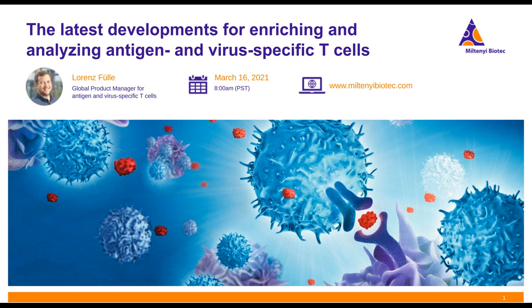All right, thank you. Moving on to your next question, when will the whole blood kits be available for analysis of SARS-CoV-2 reactive T cells? Yeah, this is also a very nice question. We already released an optimized version for whole blood samples early in March. So you should be able to find it on the website. It's basically the same workflow as for the PBMC kit, but it also includes other reagents that are needed to isolate and then stimulate those cells from whole blood samples.